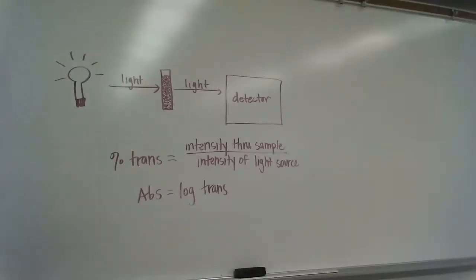So in this experiment today, we're going to be using the Spec 20s, okay? And let's talk a minute about the theory of how they work. If you've never worked with them before, it's important to take a minute to talk about what we're doing, right, so that you understand why we're doing the kinds of calculations we're going to be doing.